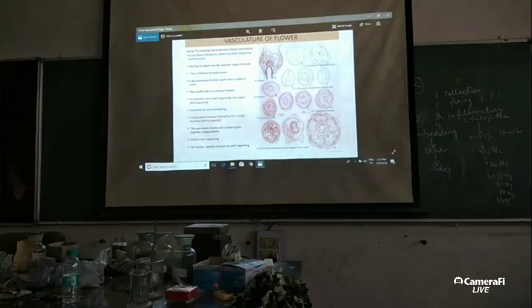And the first one, that is the C. If you see even B, that is the portion of the pedicel, and in the portion of the pedicel, because it's a stem, you will have conjoint collateral bundles arranged in a ring. If you see C, you can see there are 5 vascular bundles which have moved towards the periphery. Naturally, they are the sepal bundles. You move on to the next one, you can see the sepal traces. The 2 laterals have also appeared, and the rest of the bundles are trying to organize. And if you move on that way, ultimately you will be able to see.